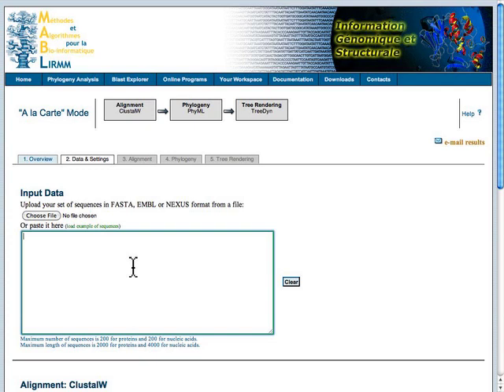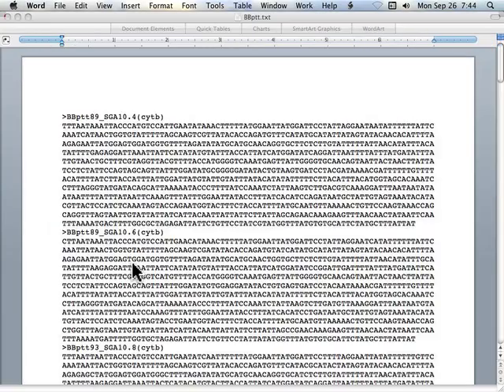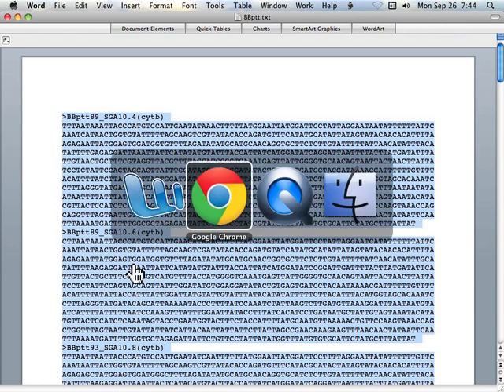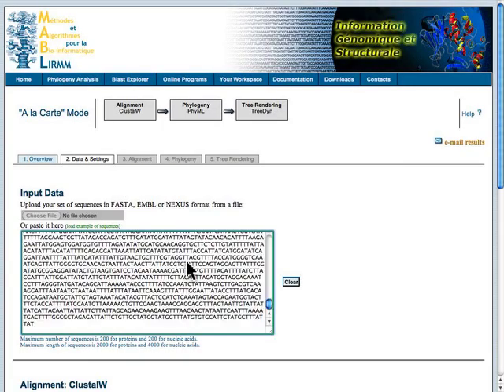We need some data. So, I've got a collection of sequence data here. I'm copying it, and I'm going to paste it into this box. Alternatively, you could add the data by choosing a file.